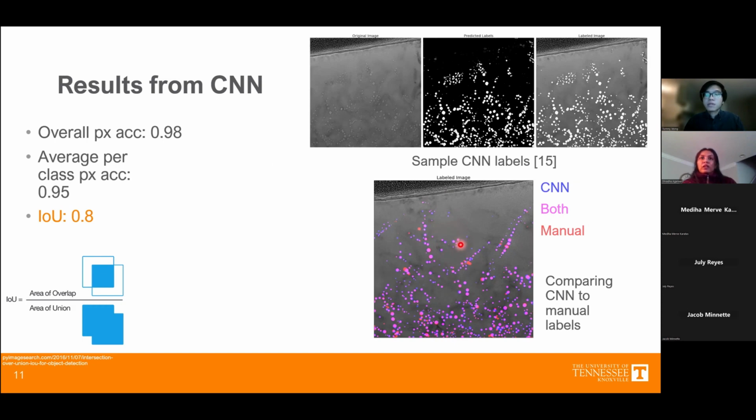To me, those values are very important. Despite IOU being a good measure and you're getting 0.8, there are two things. Once you do UNet, you can either compare directly your black pixel with your black pixel in the ground truth, a white pixel with the white pixel that you provided during masking in your ground truth. This is one way to do it.